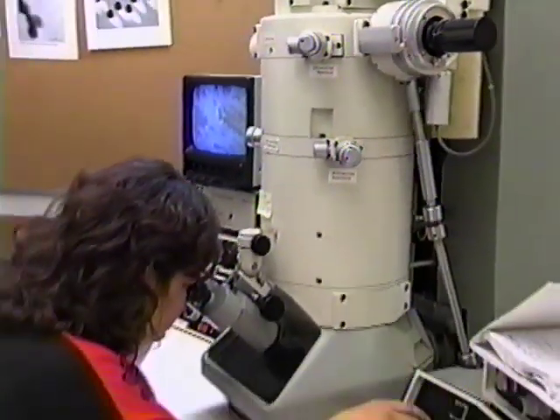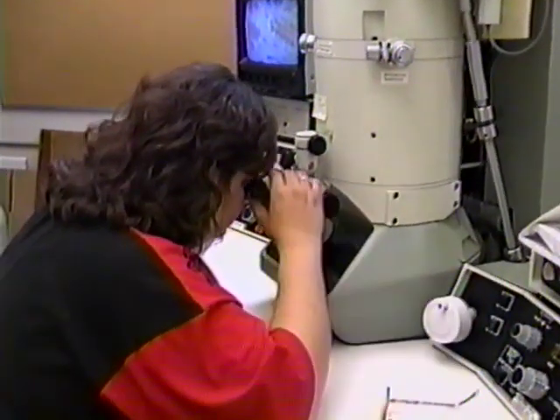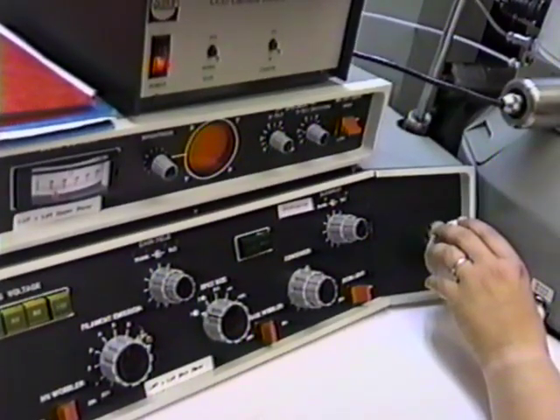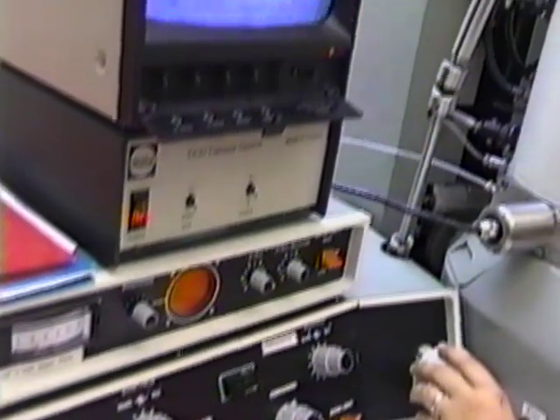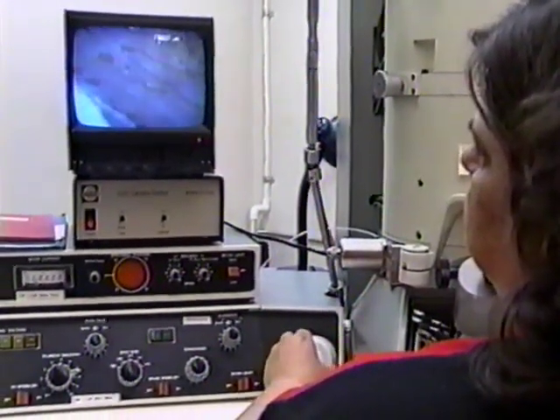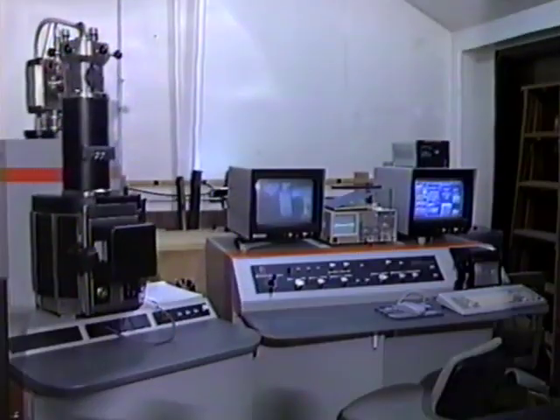These instruments are anywhere from $300,000 to $350,000. This particular one was partially purchased and partially donated by JEOL. This is a monitor that the image is projected into through what we call a CCD camera, something like the old video camera, where we can actually look on a screen and see it much easier.